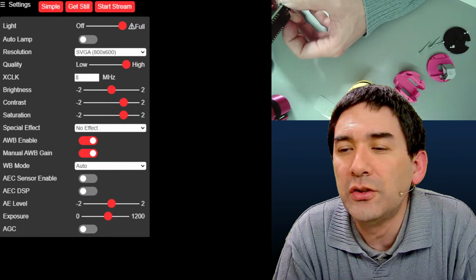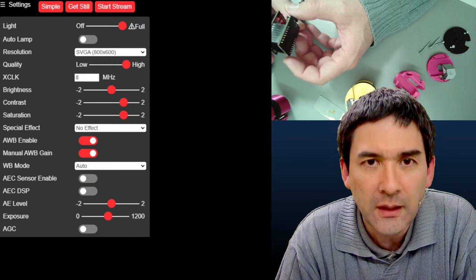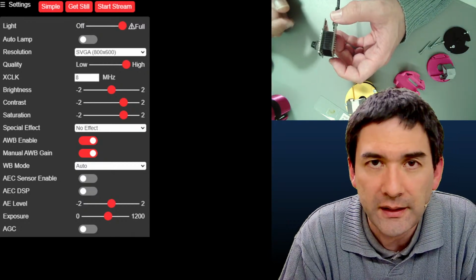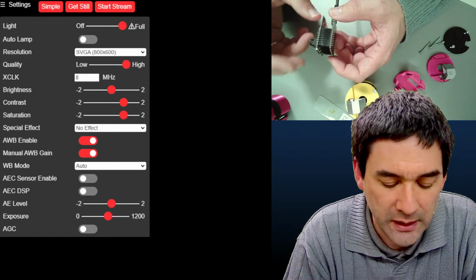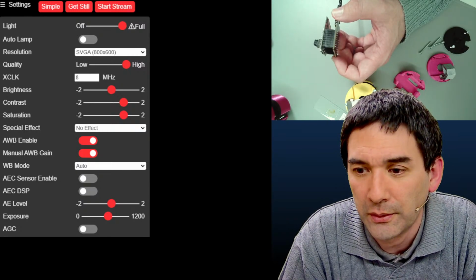Would it be easy to use as a field microscope? Yeah. As a matter of fact, the way that I see this whole project is as a little bit of a proof of concept, so that even if we get it to work somehow like this, and if we're able to connect over wireless to a mobile phone, then if we improve on this a little bit, maybe we can indeed have a very portable and easy field microscope.